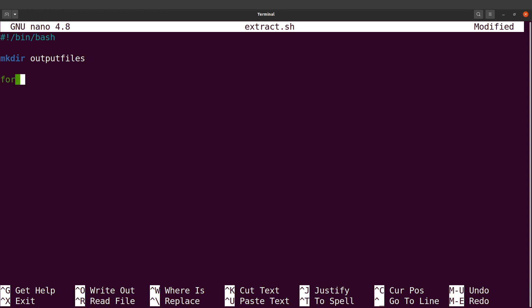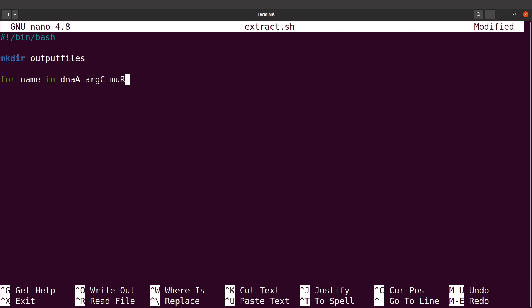I'll say "for name in" and I'm listing the names — those that we find in the text file. I have a total of four names. Once I do this, I'll move to the next line and say "do". Here, what we are going to do is save the names to a text file, because seqkit requires a file which contains the names of the sequences of interest.